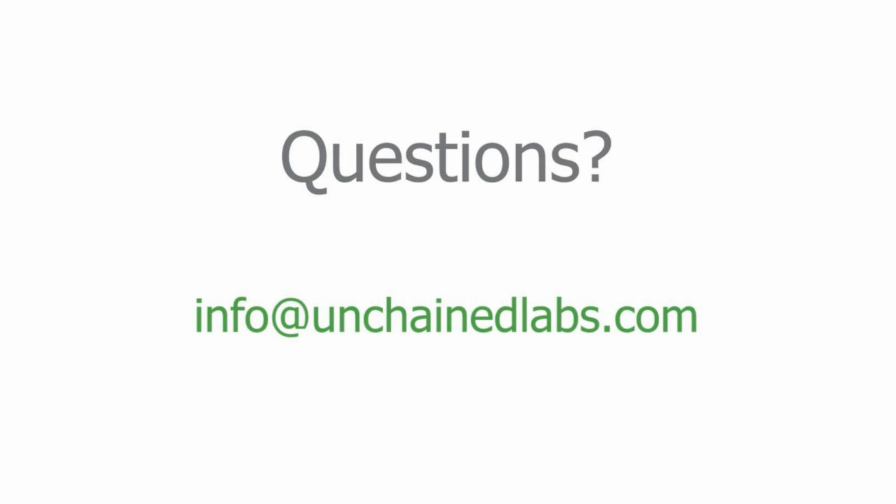Great, and we're getting great questions from our audience in here. This next one asks, what are the mechanisms for genome injection before capsid disruption? So this one's interesting because if you dig into the literature and try to check out all the biophysical studies, it's not been a totally solved mechanism yet.